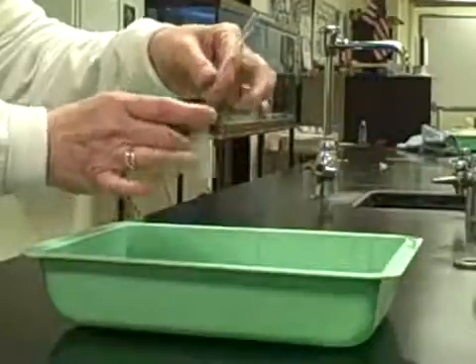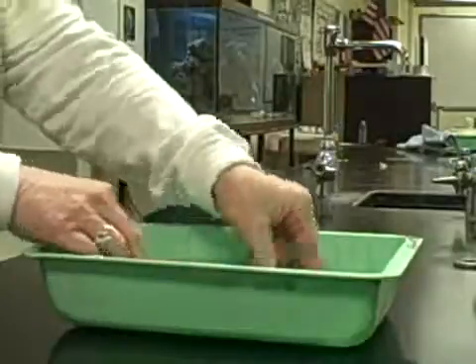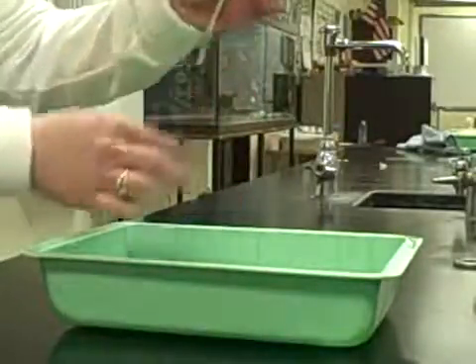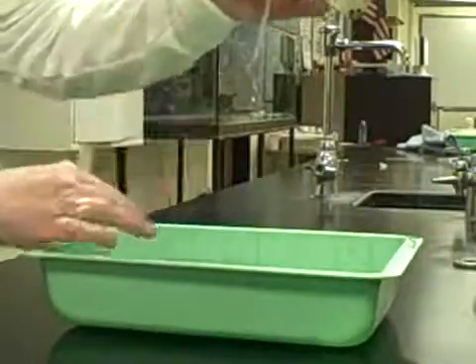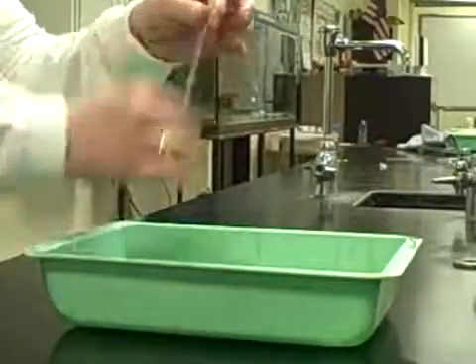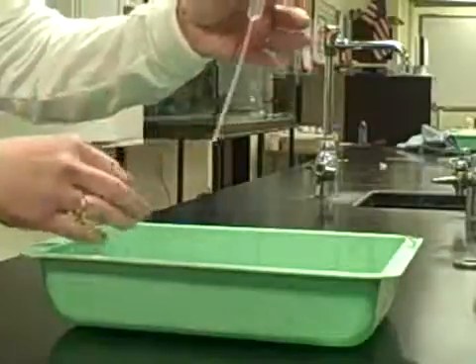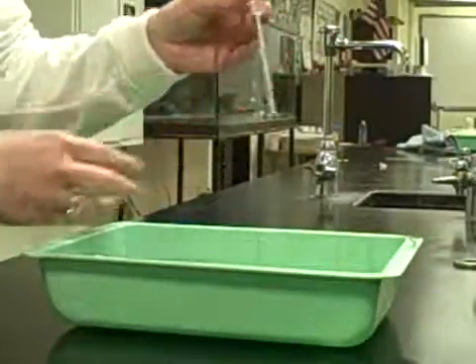Again, tapping will tend to make the bubbles move up. So I'm just going to, one more time. Now I've got it completely full, and as I look at it, I don't see any air bubbles in there. Then I want to drop the water from this pipette and count how many drops are in here. It's important that you wipe it off. I'm just wiping it off with my hands, but my hands are dripping a bit too. So I would suggest you get a paper towel and make sure you have any extra water off.